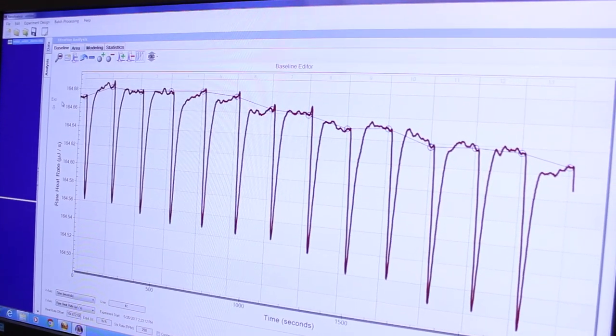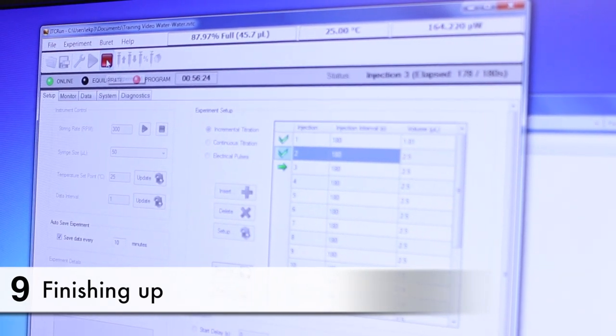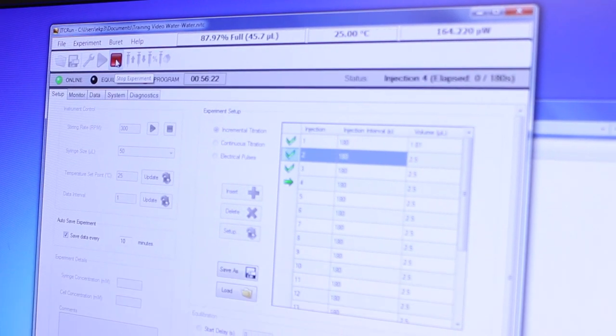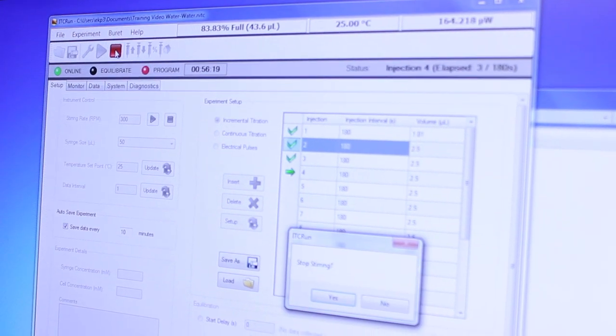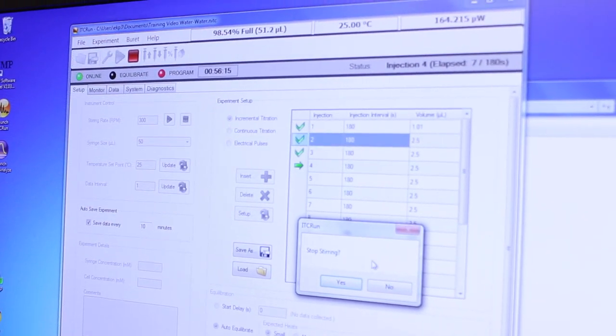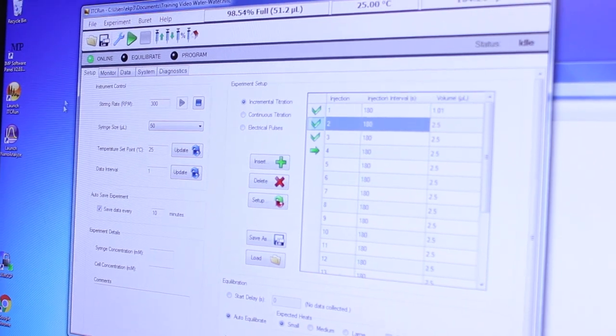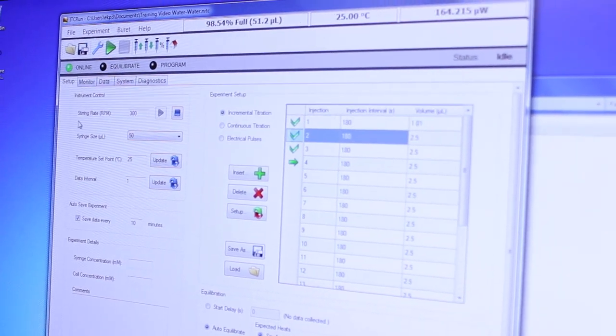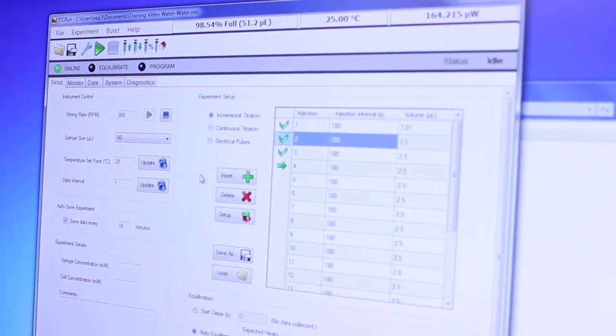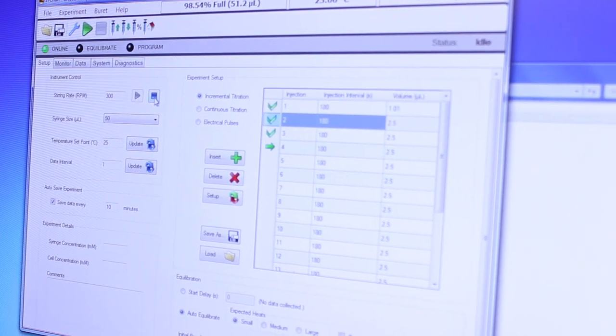If you wish to stop the data collection early you can click the stop experiment button here and it will ask you if you want to stop stirring or not. If I choose no it will stop the data collection but continue to stir and if at some point such as now we wish to stop the stirring we can click on the stop stirring button here.